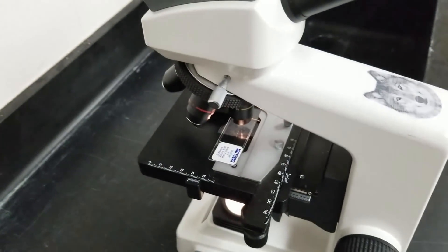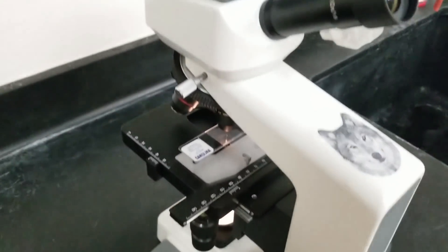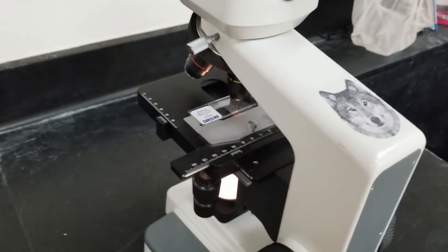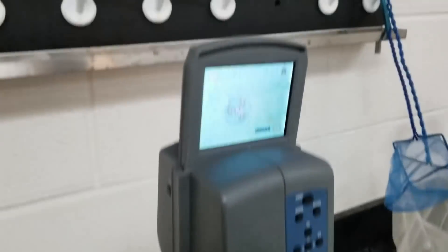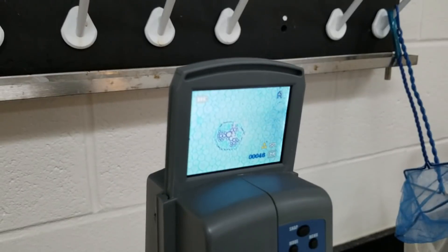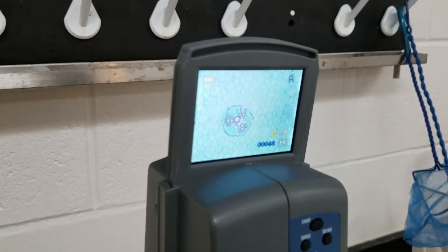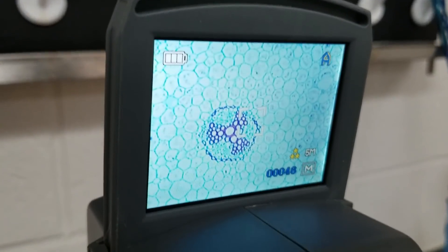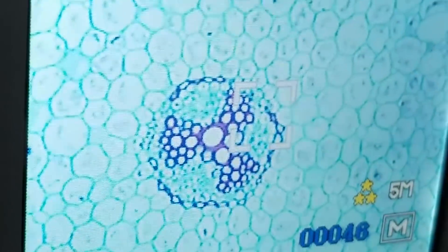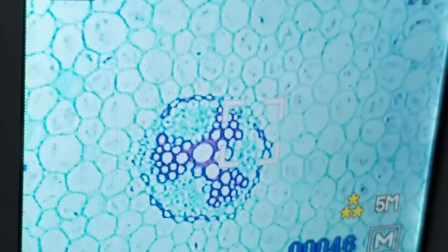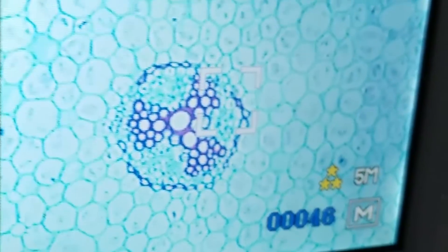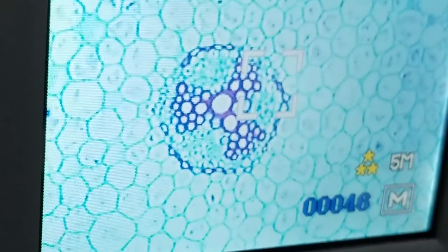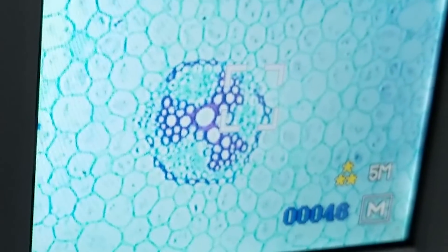Some microscopes will only have three objectives, but every time you go up, you want to start at the lowest one, center it so that when you zoom in even more, you can actually see what's going on and you don't have to find whatever you were looking at again. You want it to be as dead center as possible so when you zoom in, you can still see the actual slide.